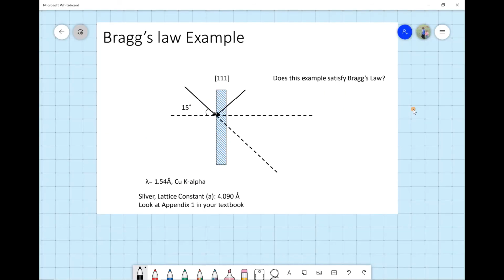All right, so we have our Bragg's law example. This is 111. I've drawn it with this little angle to show you that it's 111, and I'm almost scolding myself for the way I've drawn this. So this would also be theta. This would also be theta. If you look at the way I drew it, it makes you think that it's always 45 or always 90 degrees. That's not necessarily the case. It's just the way I drew it. Collectively, this is 2 theta.